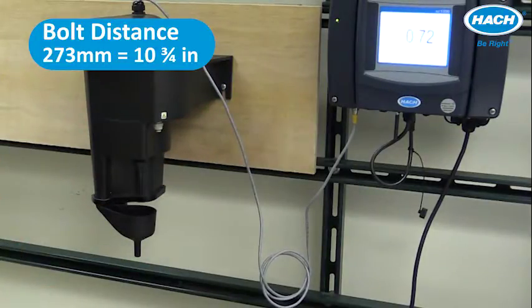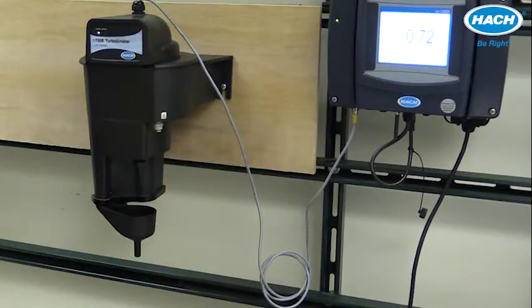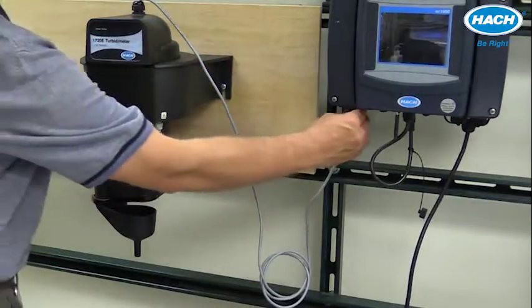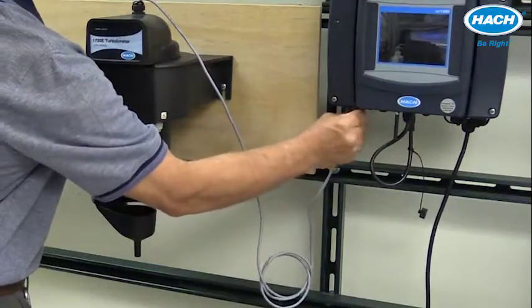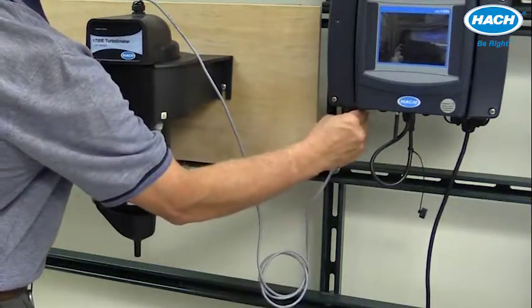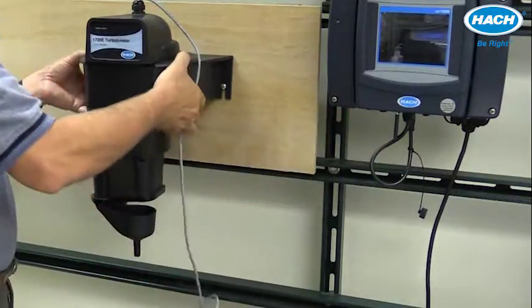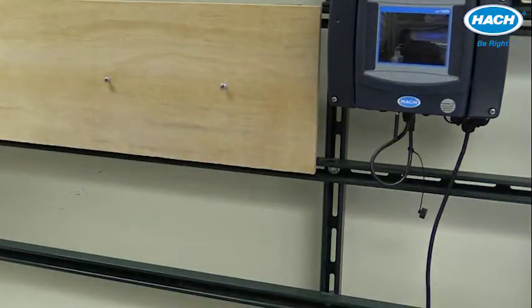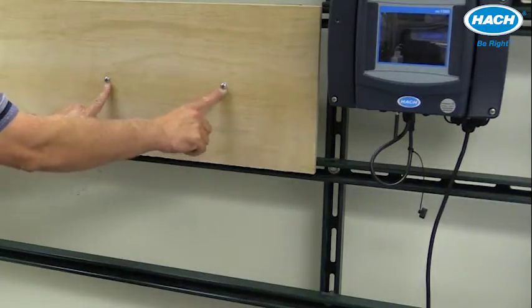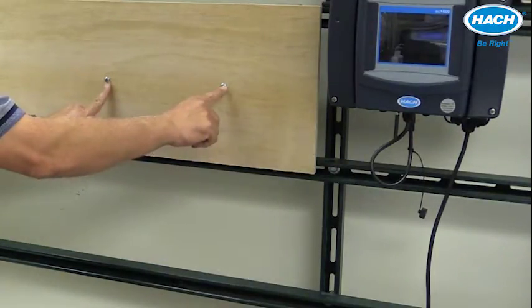To start the process, turn off power and disconnect the existing instrumentation from the controller. If you're not replacing an existing instrument, simply mount two bolts 10 and 3/4 inches apart and make sure that they're level.